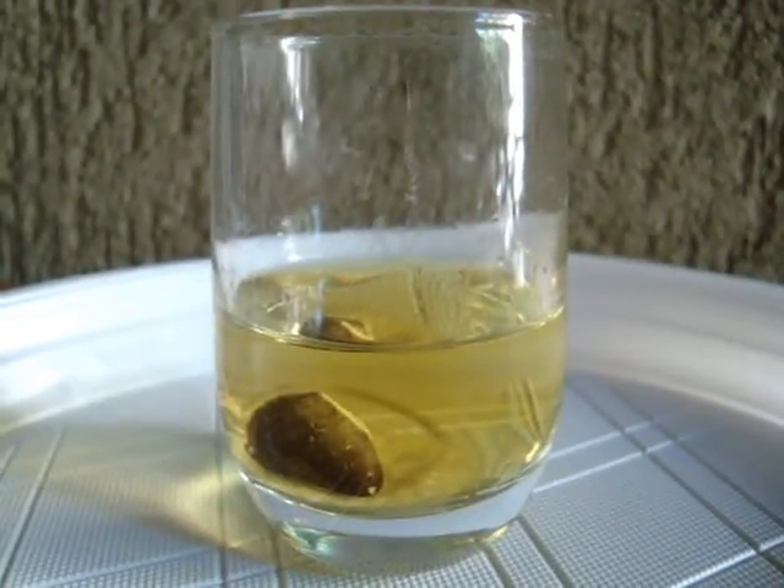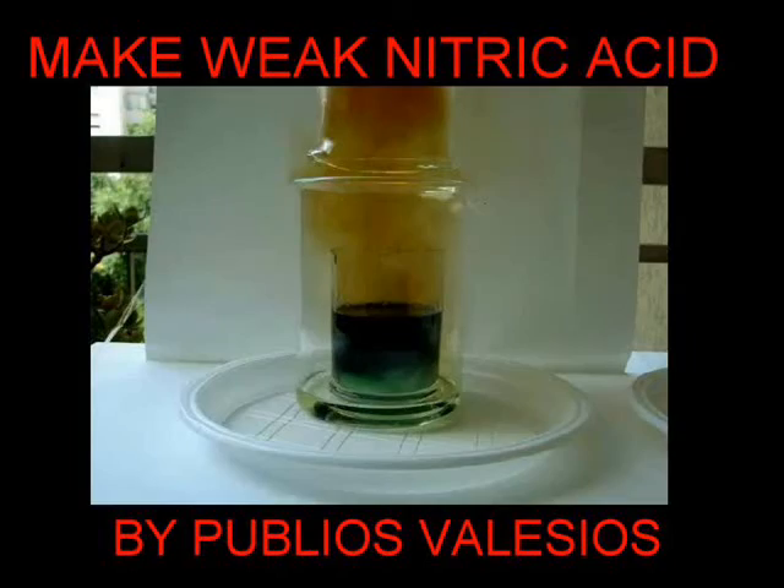Here we can see a lead nitrate solution. Because of impurity, it appears yellow in color and a white powder of tin is present on the bottom. Tin, in fact, is used normally in common lead items. That's all folks.